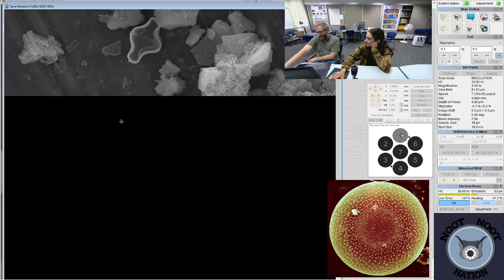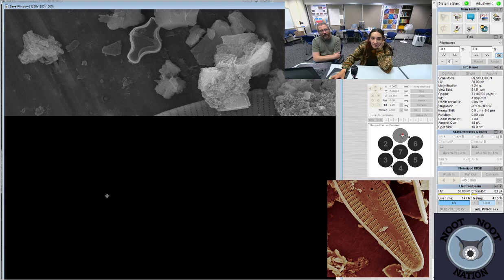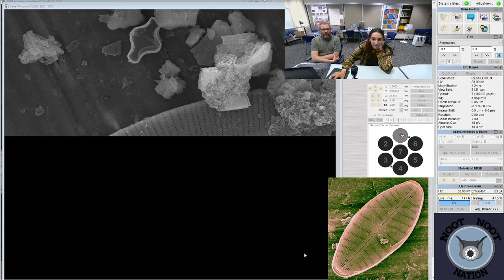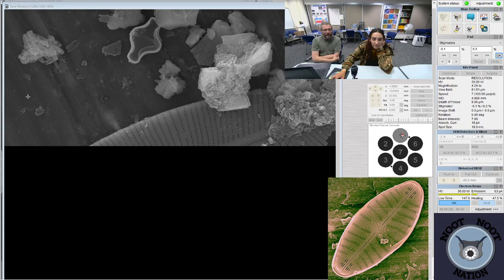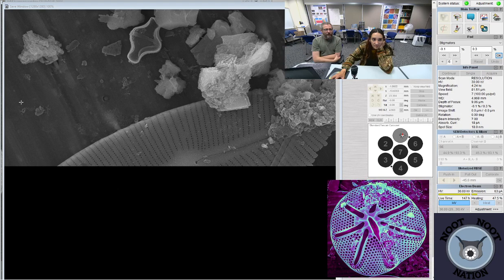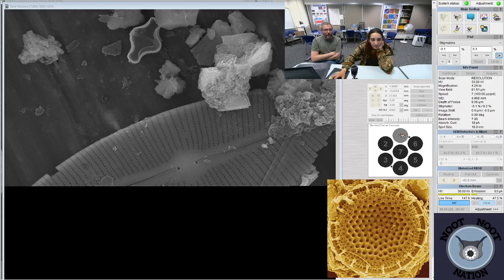What's the purpose of the X's? The X's on the skeleton are just pores. So it's a way for them to exchange nutrients and waste products with the outside world. It's basically communication to the outside world. In reality, there's an organic coating over the diatoms when they're living. So while the skeleton has holes or openings in it, it's not like organisms can just scoot through those. But they need to have some way to get nutrients into their body. So it's primarily through those little windows. And I think they excrete some waste products out through them as well.